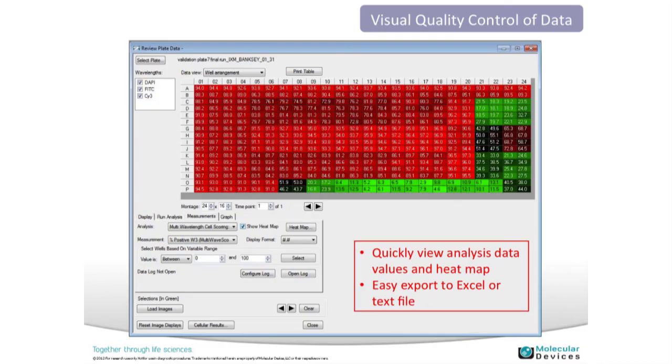Once the analysis is run over the whole plate, you get a visual QC of results via configurable heat maps. The workflow involves having an idea of how your samples will react to treatments, wanting your images to confirm that, and then on a larger scale confirming back what you saw once the analysis is run over the whole plate. You want to easily identify your controls — confirming the software was able to — and see any trends in the numerical results.